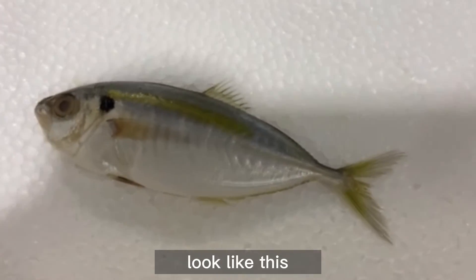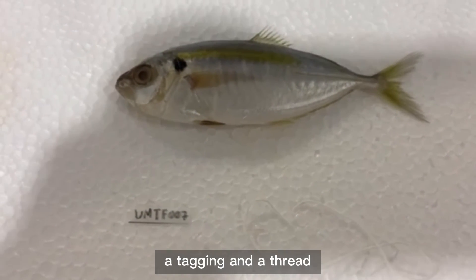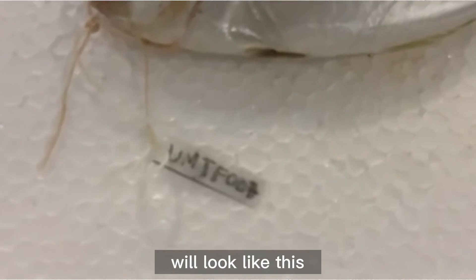Your specimen is going to look like this. Don't forget to take some pictures. The next step will need a tag and a thread. Insert the tag from the operculum and your specimen will look like this.